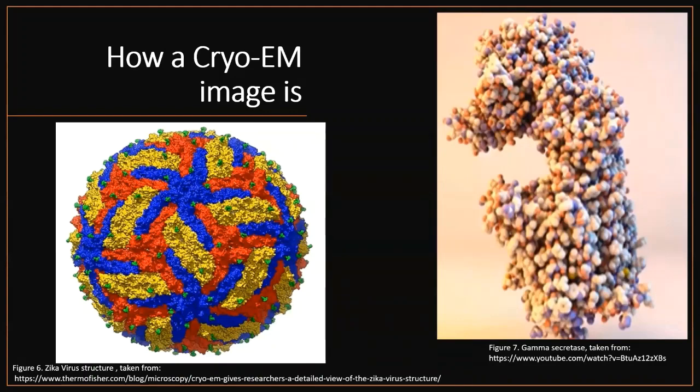Here we can see some examples of the images that cryo-EM provides. We can see here the Zika virus structure, and we can see here the gamma secretase structure.